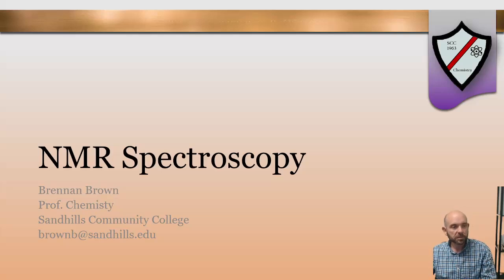Hey everybody, Professor Brown here, and in this video I'm going to cover NMR spectroscopy, which is a technique that we use to further characterize molecules in the organic chemistry laboratory. We'll describe what the spectrum can tell you and look at some examples throughout this set of notes. So if you will, follow along with me and we'll learn all about it.